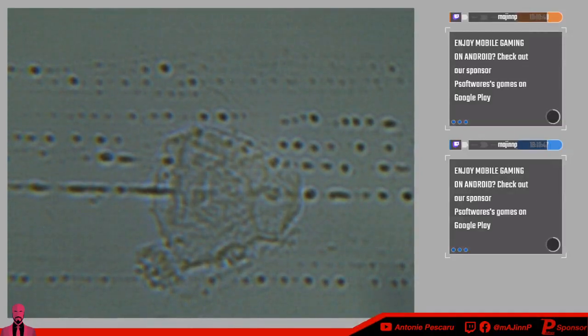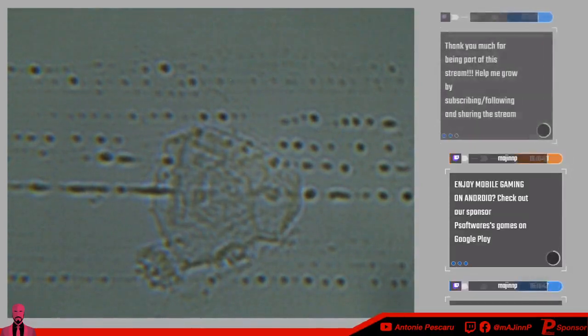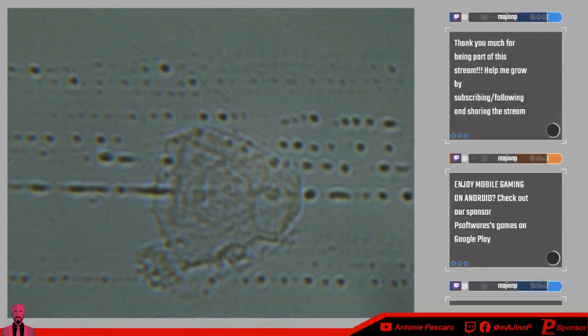If I can name you all of them, I'll probably sound too overpowered, but that's pretty much it. There's also organelles, because you start from the smallest, which are molecules, then you move on to organelles, and then the cell, and then etc. And I think there's like 9 or 10 stages, but whatever. So that was it for our epithelial buccal cell.